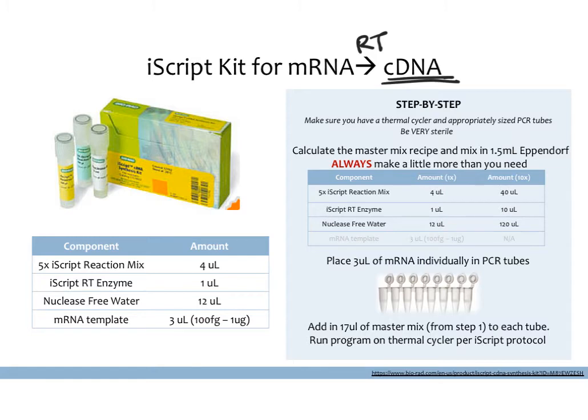So most labs have a kit that they use, and there are many kits available for doing this reaction. This is just one of them as an example. It's the one that we use in our lab. But like I said, your lab may have a different kit, and the basic idea is the same for all of them. Every kit will have an insert that tells you the exact recipe to use.